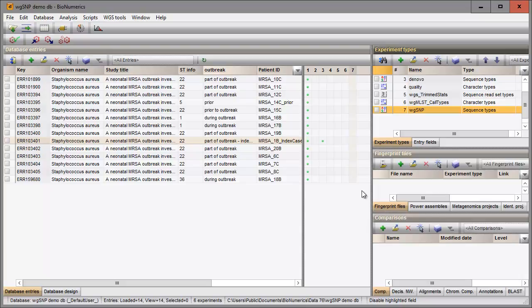There is a de novo assembled sequence present for one entry in the database. I will use the sequence as reference sequence by copying the sequence from the de novo experiment to our new sequence type experiment.